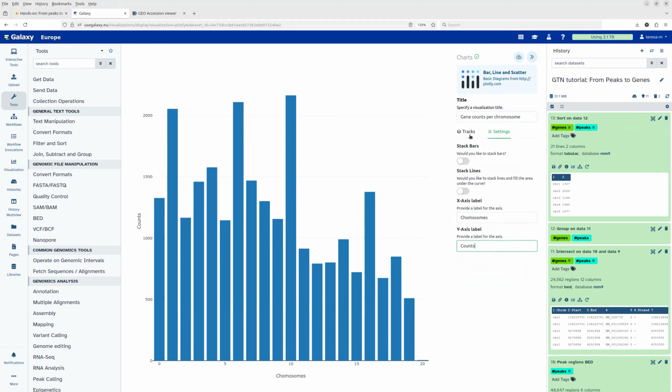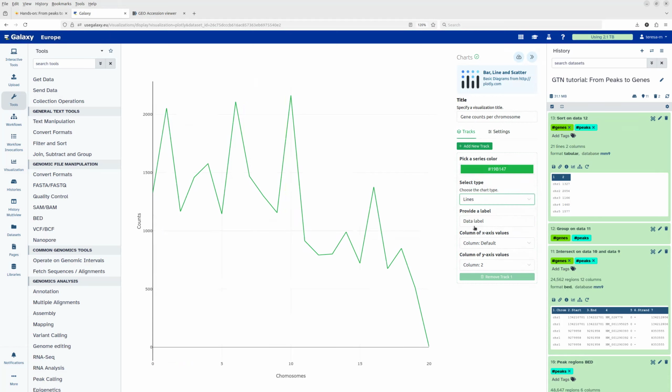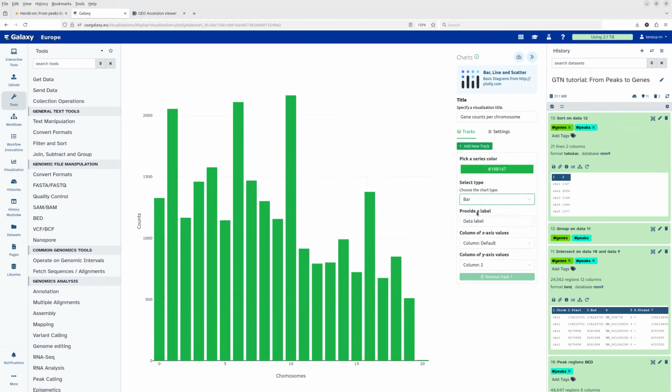And I mean, you have many different options. You can also play around a little bit. You can select a different color. Maybe you want to have pink or green, whatever you like. And yeah, just see, you can also select another plot, but a bar plot in this case makes more sense. I would encourage you to just play around with the options here a little bit to familiarize yourself.